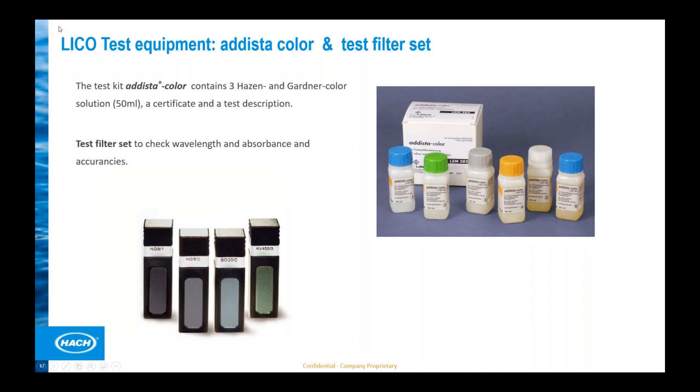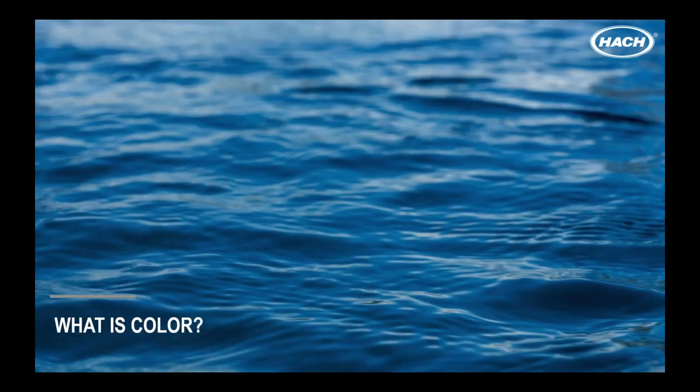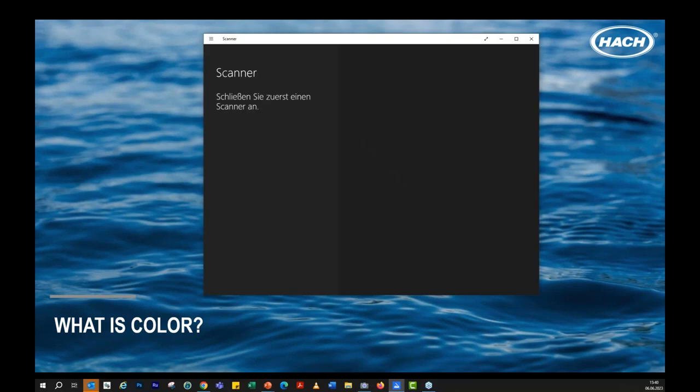I will then go ahead with the basics of the color measurement. So give you a little bit in details about how the theory is behind color measurement and how the instrument works internally, and how to define a little bit background more about the color spaces itself.